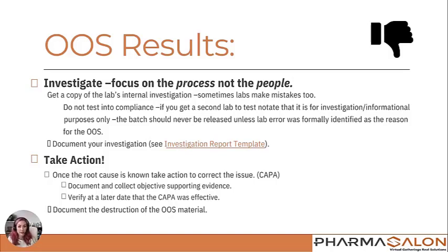I mentioned out of specification results. Those have got to be investigated. You cannot get OOS results and stick them in a file and call it the end. You have to investigate those results.